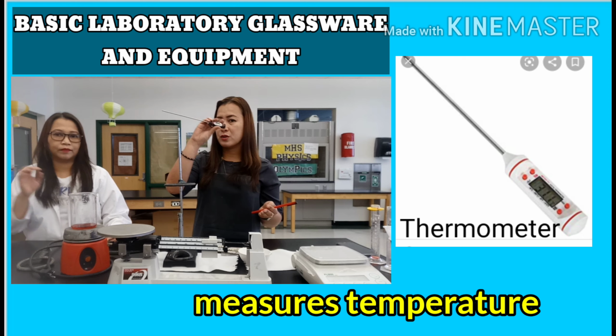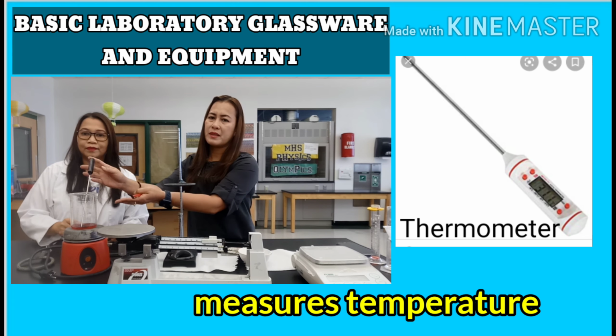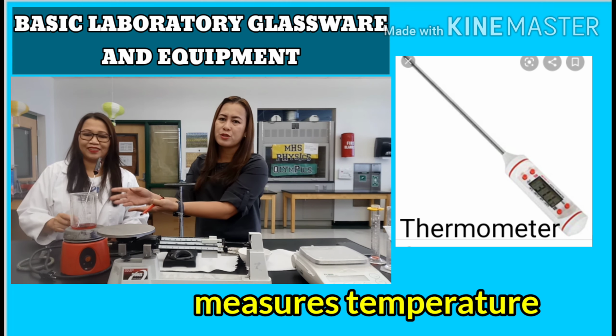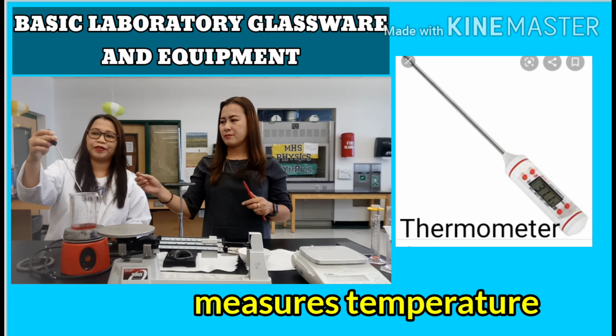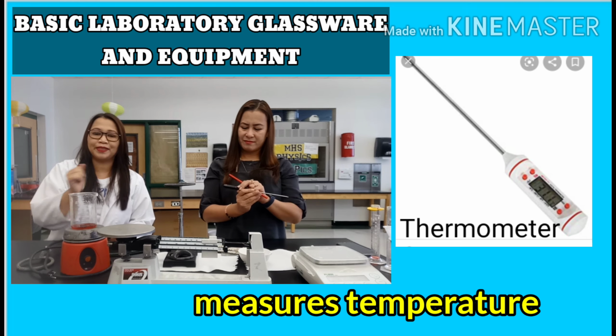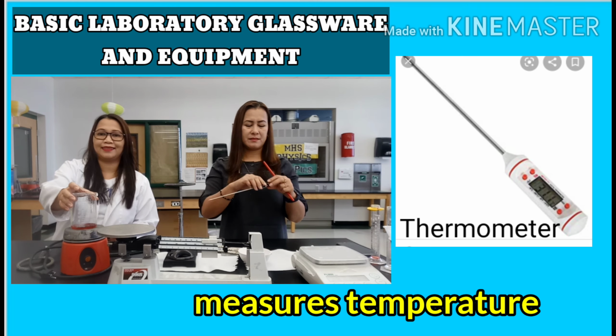So we will be using our thermometer over here. Just put it in for a certain period of time, and then check what the changes of the temperature are. And there you go. You will read instantly whatever is the temperature of this substance. For this one, we have the degree Celsius and the degree Fahrenheit.